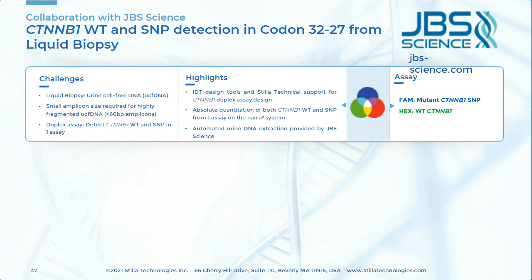Urine cell-free DNA is highly fragmented, so the first challenge was to design a small amplicon of less than 60 base pairs to cover this mutational hotspot. Next, we had to take this small amplicon and create a duplex assay with probes to distinguish between the wild type and the SNP. Therefore, for accurate and precise quantification, the probes need to be highly specific.